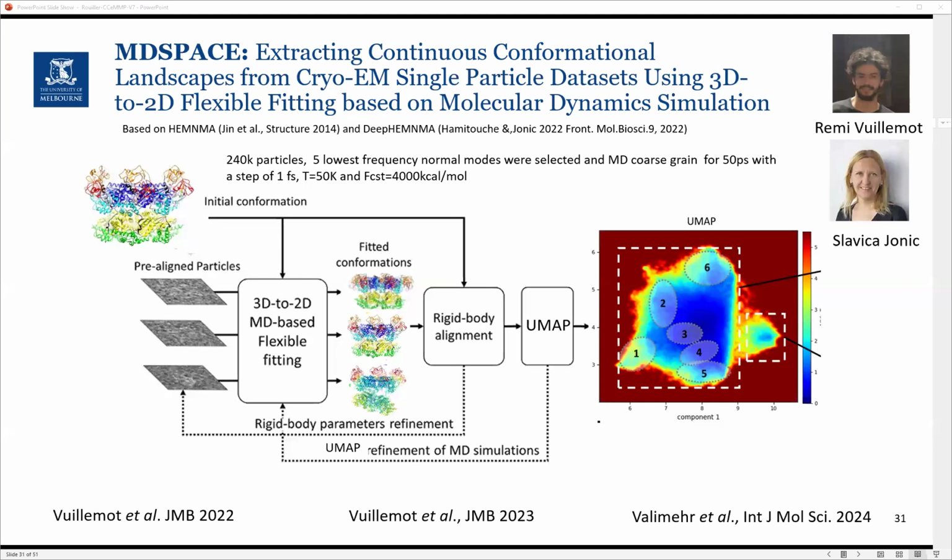It's unique by the fact that we are fitting the data directly to the 2D image, while those other methods that you mentioned do almost discrete classification or get a large range of different individual volumes, and then they use MD to fit into the 3D volume. What we're doing is different because we are fitting to the 2D image.